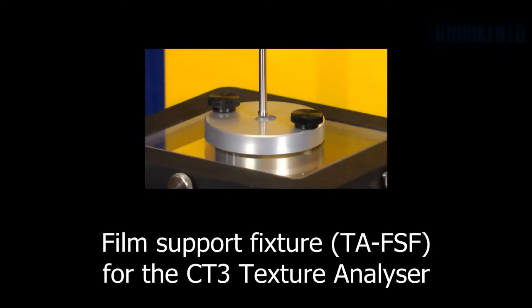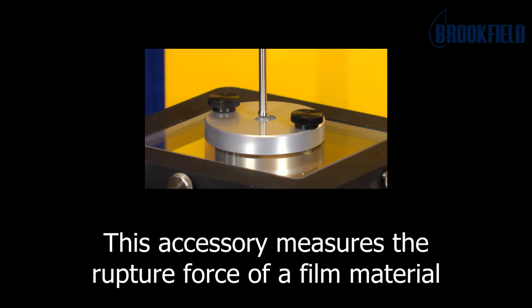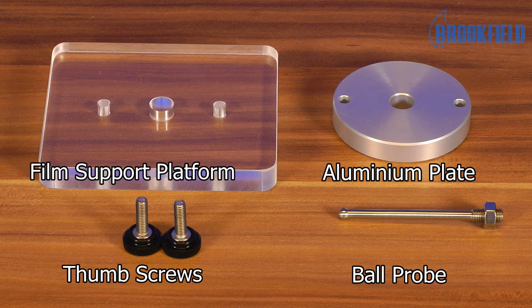This is the film support fixture for the CT3 Texture Analyzer. This accessory measures the rupture force of a film material. Here you see the individual parts of the accessory.